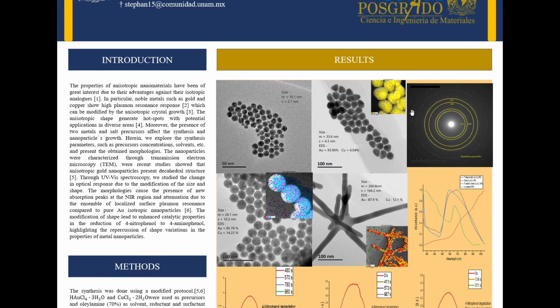We show here in the results the morphologies. Our control will be the gold seeds, which we will compare, not only the morphology but also the catalytic activity.